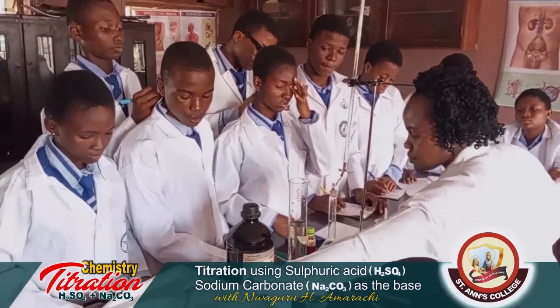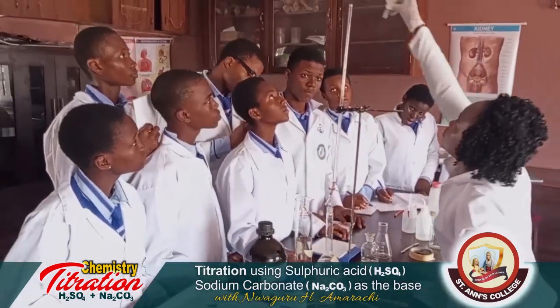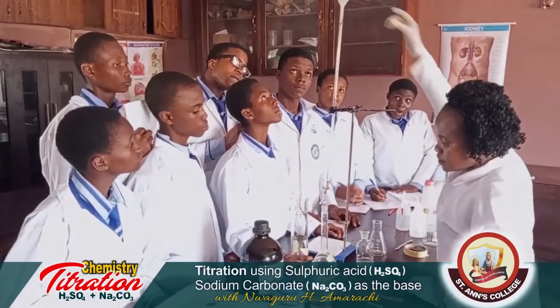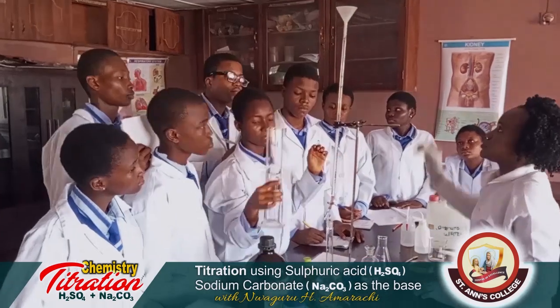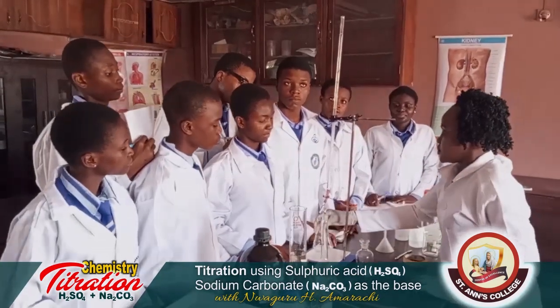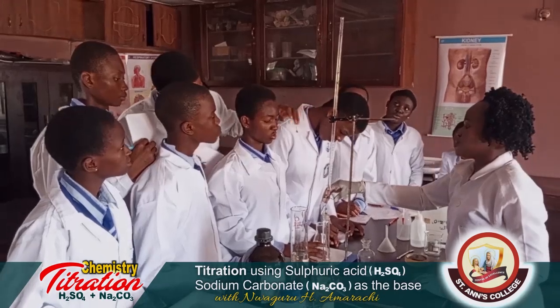Then we discard. Refill our burette with our acid. Then adjust the volume to get down to 0.